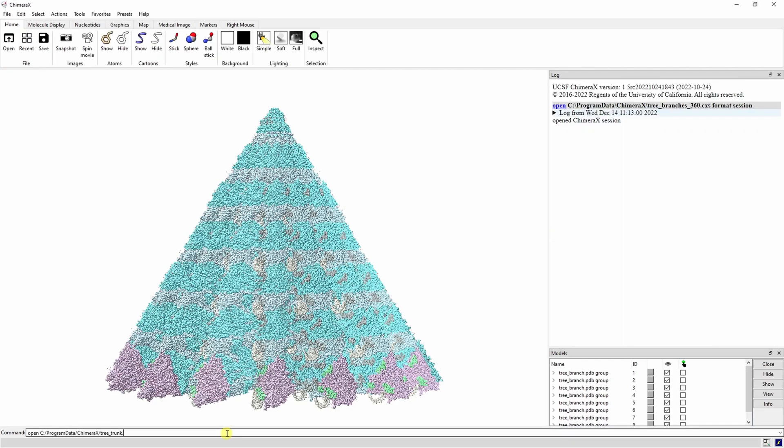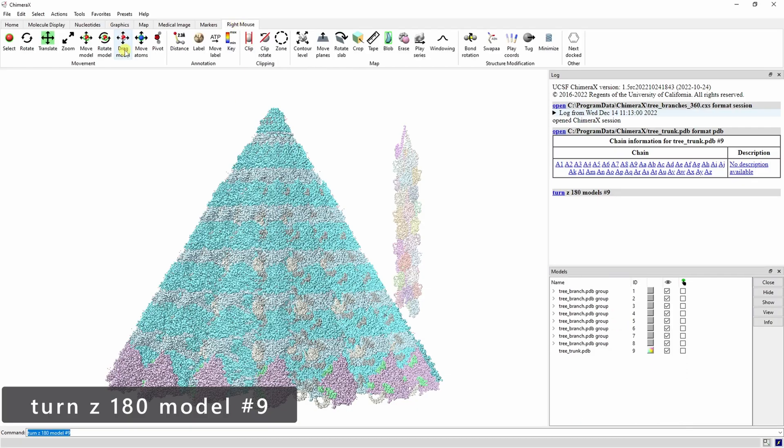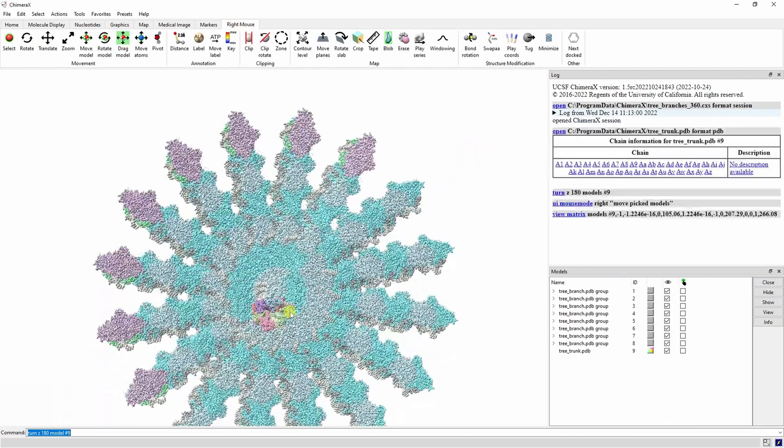Now let's open up our tree trunk PDB, flip it upside down, and drag it under the tree branches.